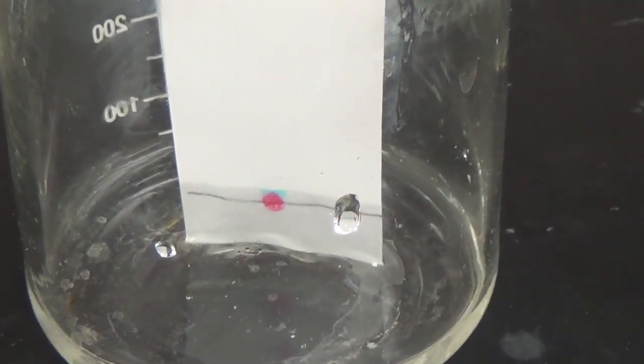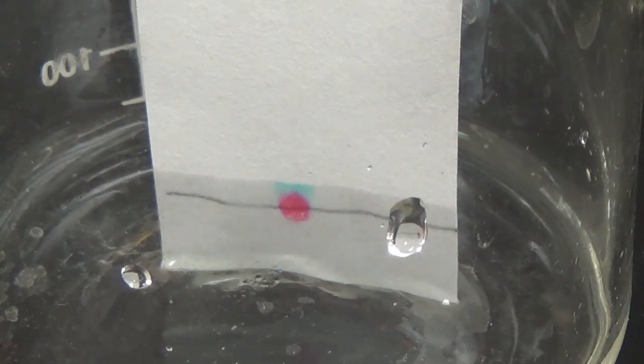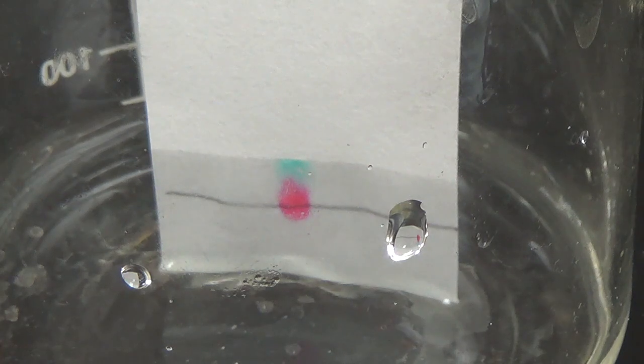I'm going to zoom in. You can actually already see some splitting. And it's just going to continue for a while. So if from this point in time you want to fast forward the video and watch it develop, I would recommend that. Just be sure you catch the very end as to what we do to finish it off. So hang out with the video going and I'll let you know when we're ready to finish off, but you can already see how we are qualitatively separating.